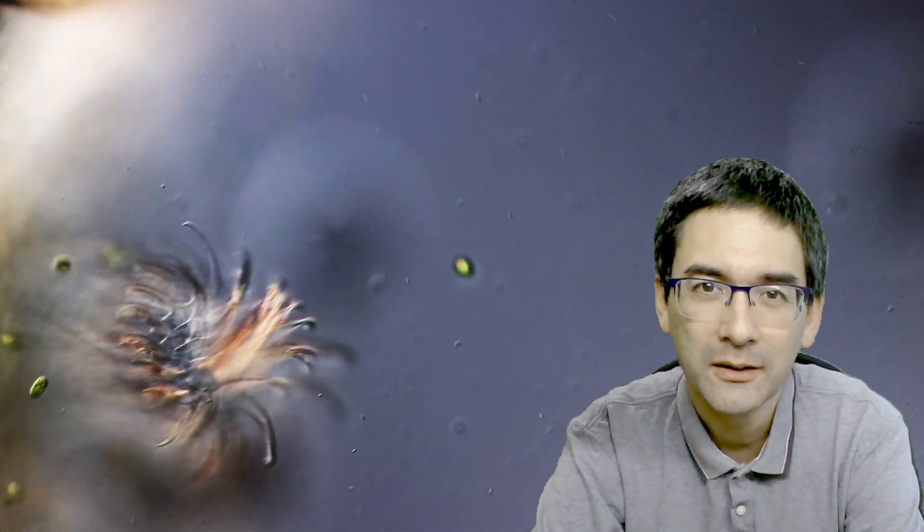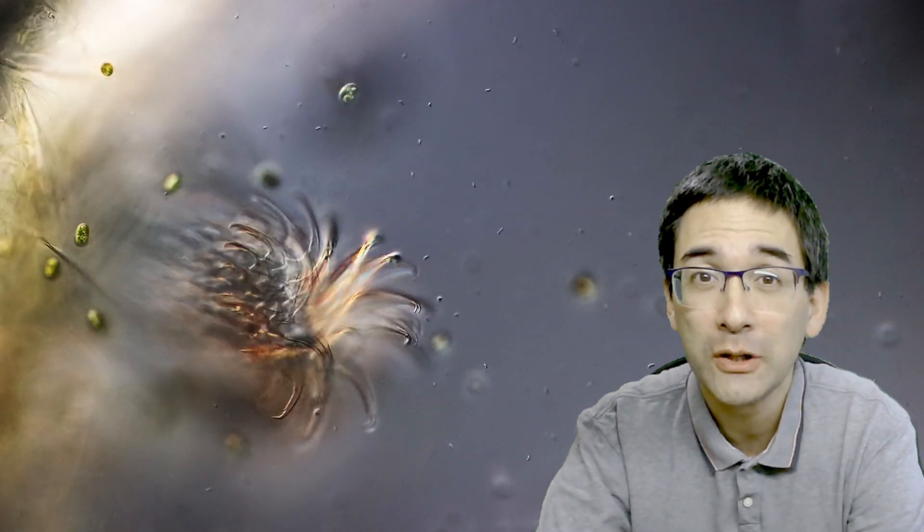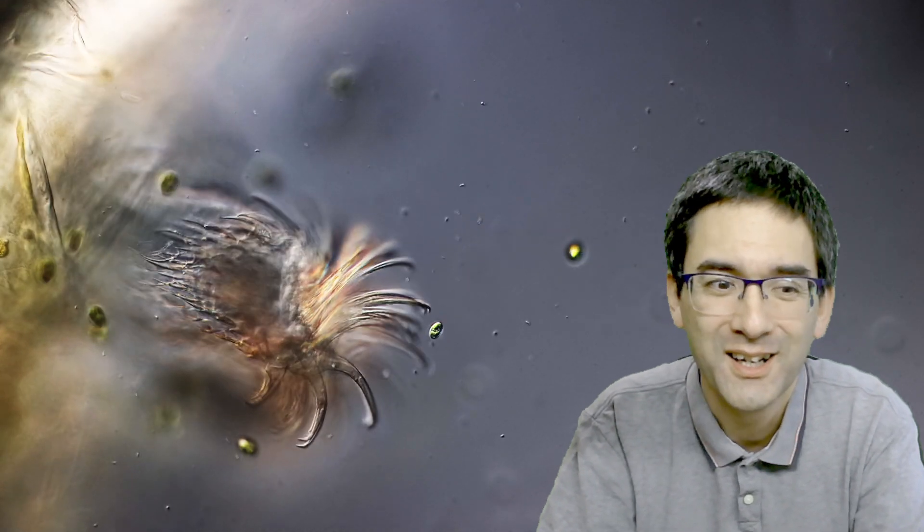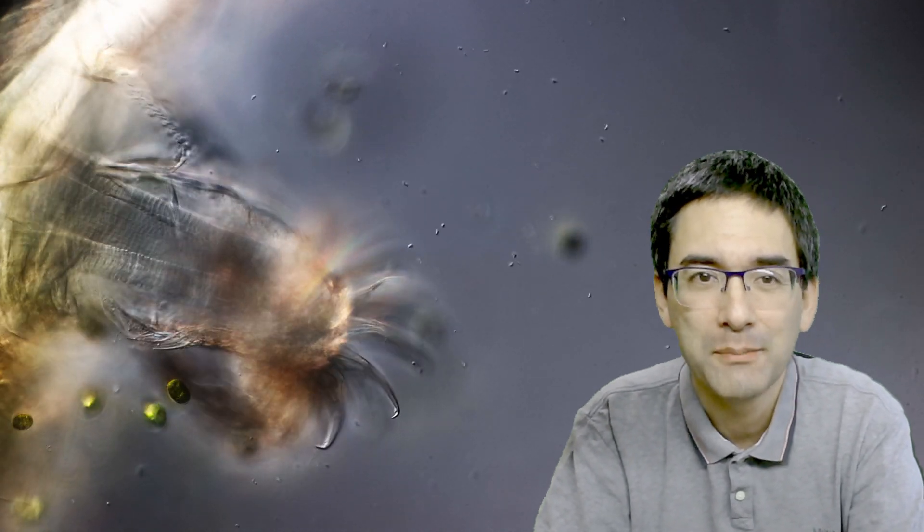Yeah, they're tiny little feet here, and those feet are quite interesting because there are many little hairs on them. Those hairs allow the midge to actually crawl and move forward on a very smooth surface, such as a microscope slide.